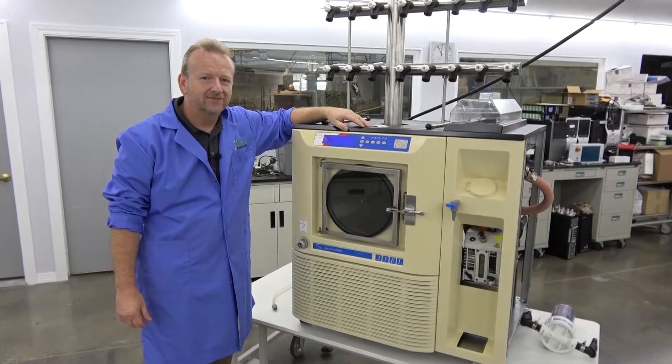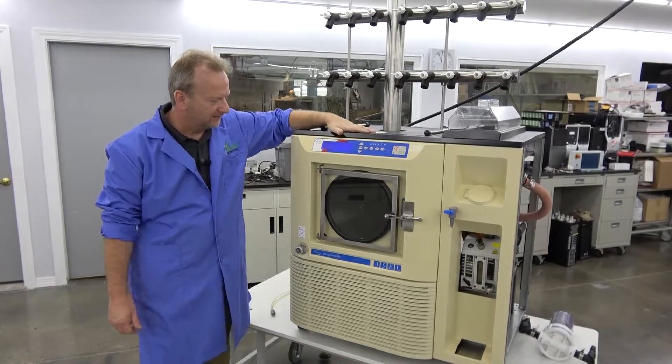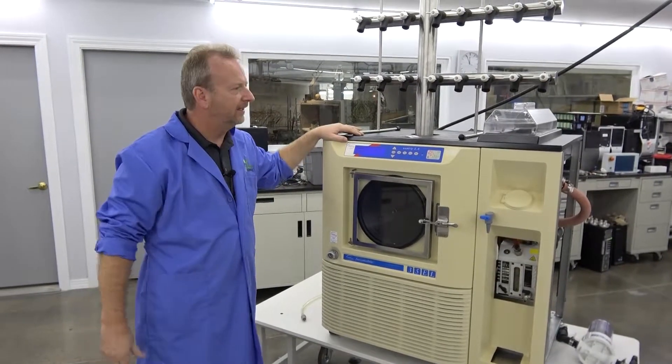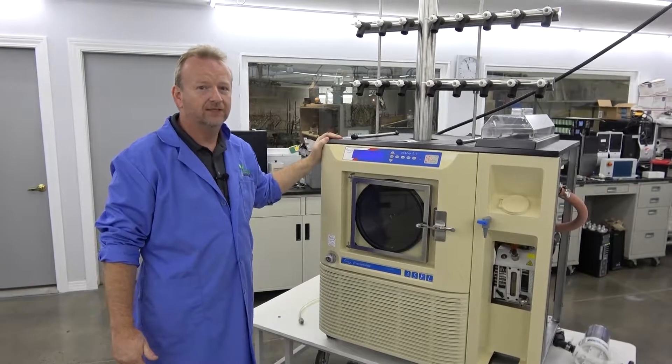Hi, I'm Rich here at New Life Scientific. I'm back in our tech shop, just finishing up the Virtus 35EL, and I thought before we get it out and put all the panels back on and get it up to the photo area, I'm going to have a short, quick video of exactly what we did to this unit.